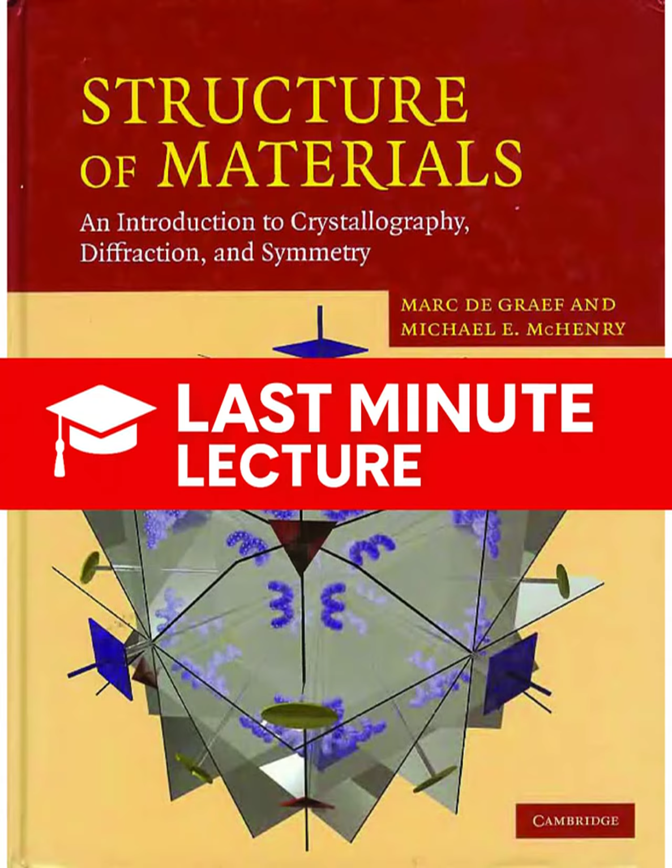governed by the incoming electron's kinetic energy. This leads to a fundamental boundary called the short wavelength limit, lambda min. Correct. The photon energy E is related to wavelength by E = hc/lambda. Since the maximum energy the photon can possibly have is eV, from the accelerating voltage, we can rearrange this. And that defines the absolute minimum wavelength you can get. It does. Lambda min is 1239.8/V, where the wavelength is in picometers.